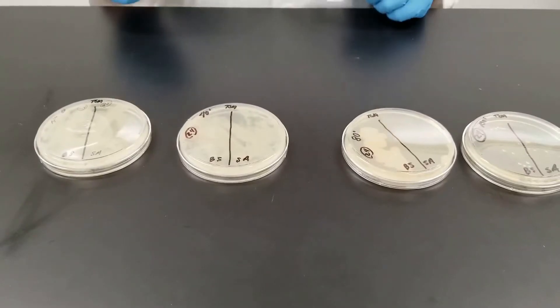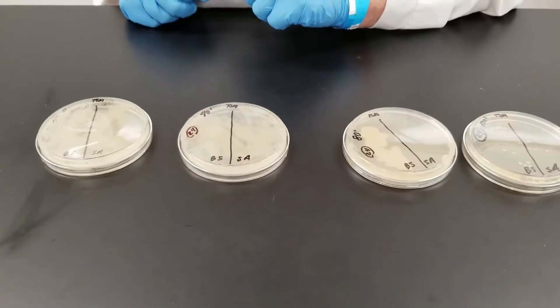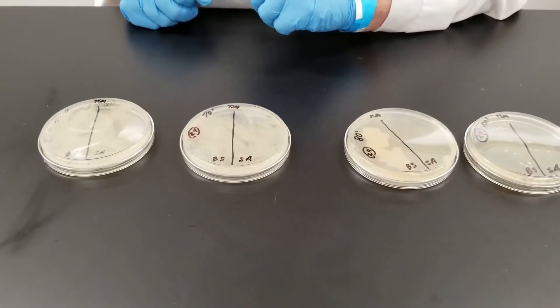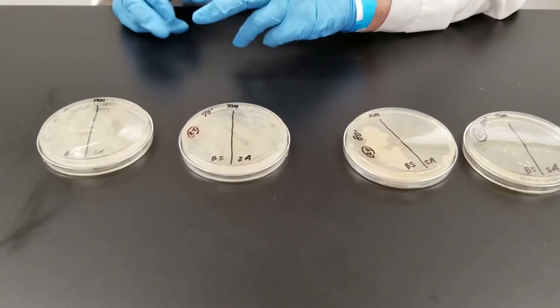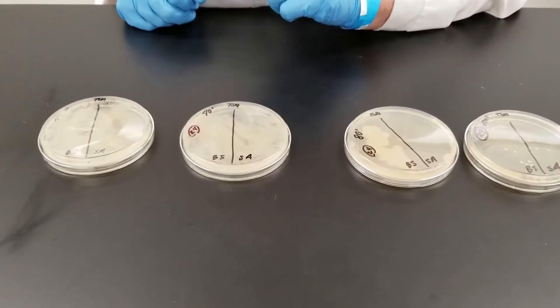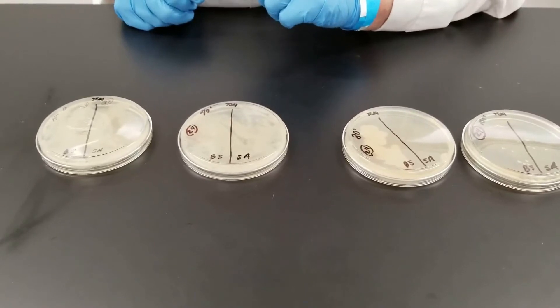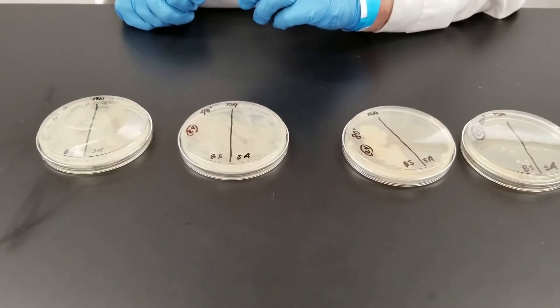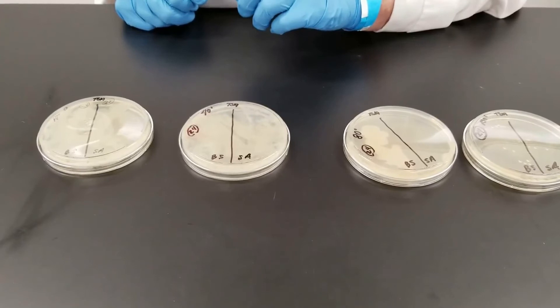This is the results of the heat tolerance of bacteria. We tested two different strains of bacteria, Bacillus subtilis and Staphylococcus aureus. These are both gram-positive organisms. Bacillus subtilis does produce spores. Staphylococcus aureus does not.